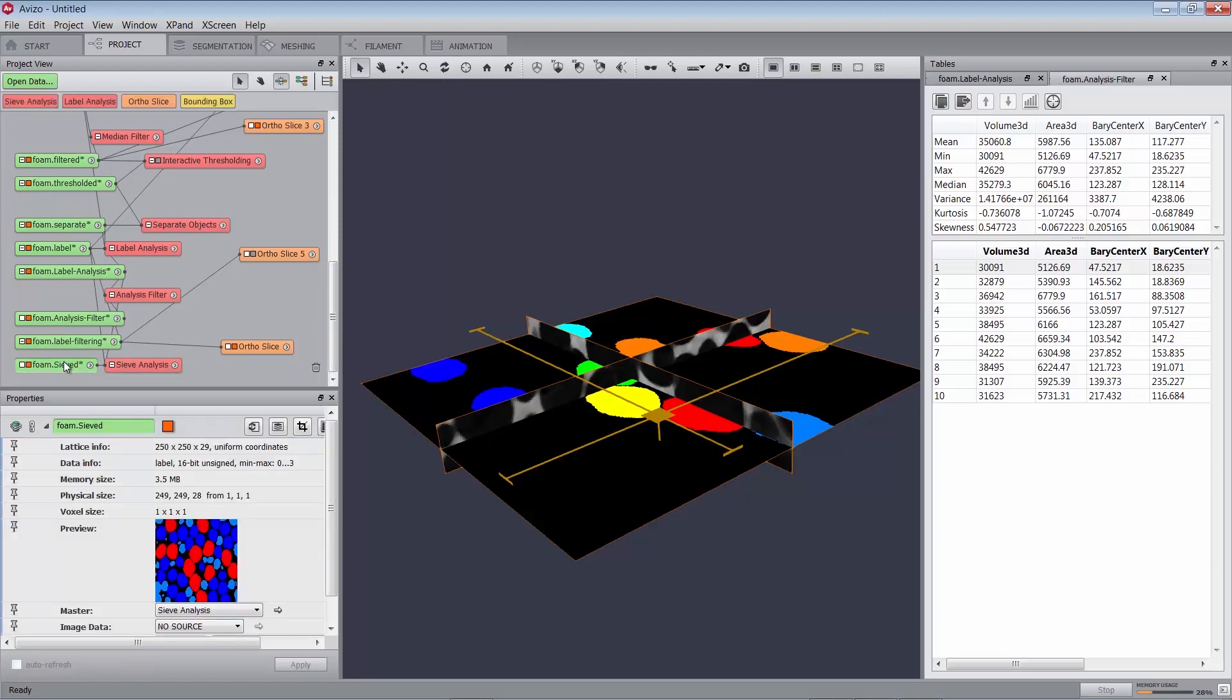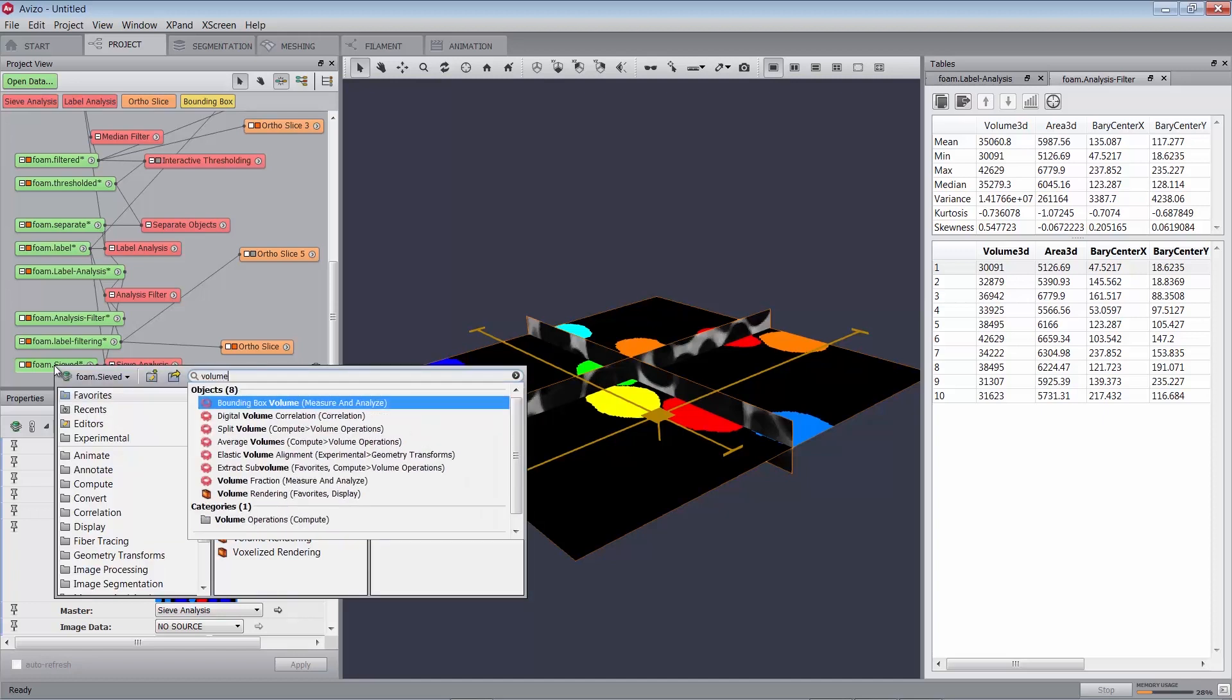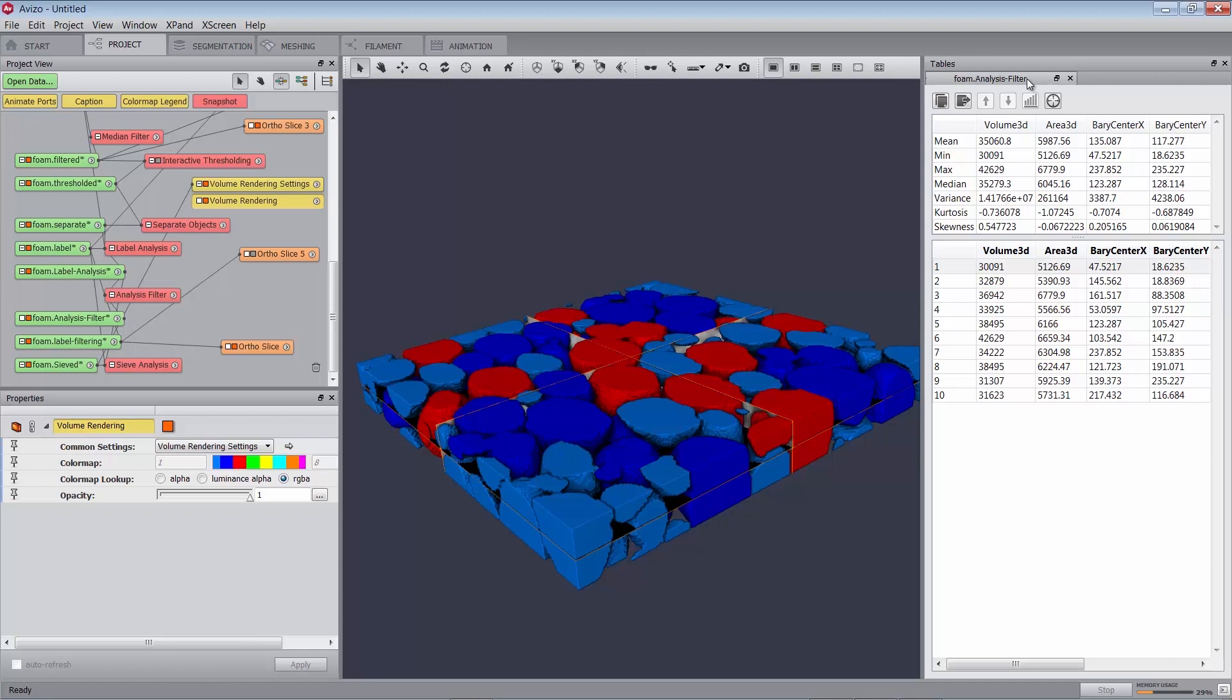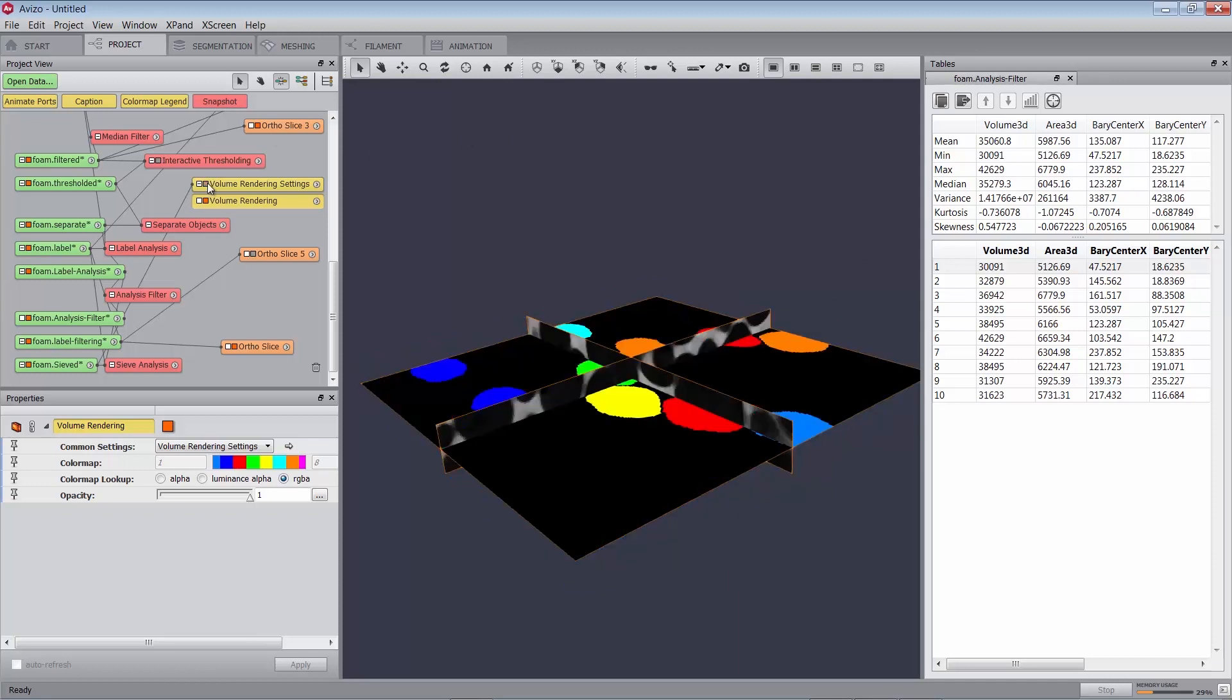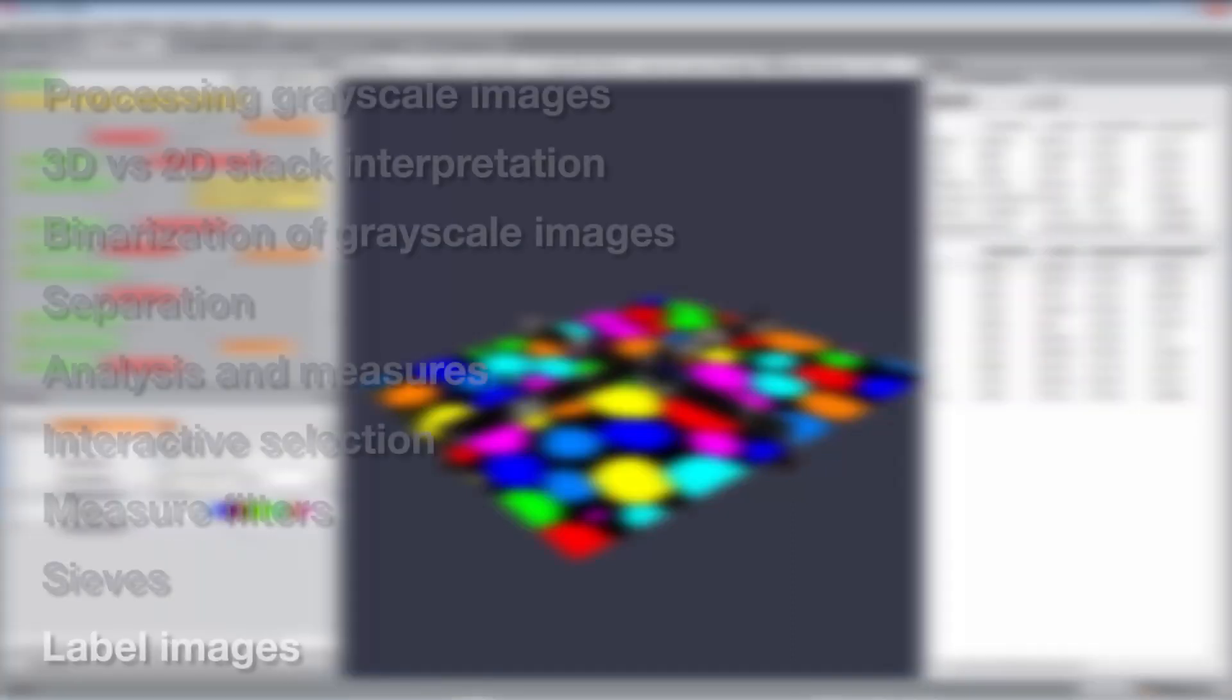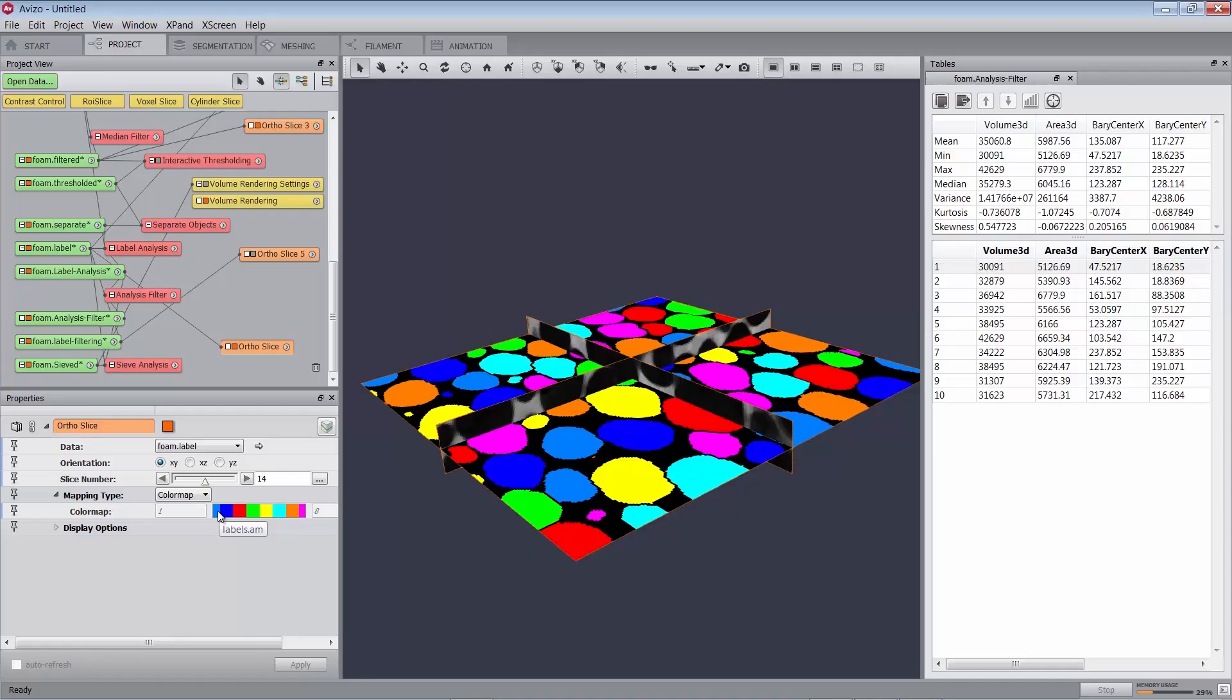Display the label image using a volume rendering module like this. Hide the volume rendering. Attach the first ortho slice to the label image foam.label. In the label image created along with the result spreadsheet, each particle has been identified and assigned a unique index. This label data is stored in this case as a 16-bit label image. Such images are displayed by default using a cyclic color map so that particles in close proximity are more likely to be shown in a different color.